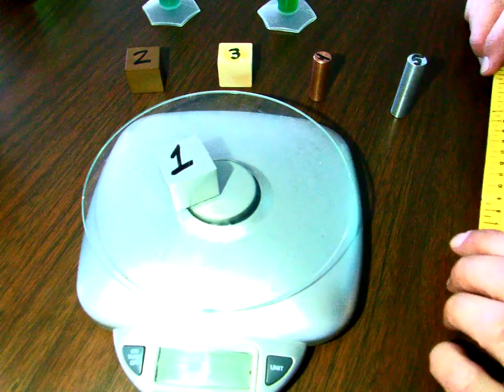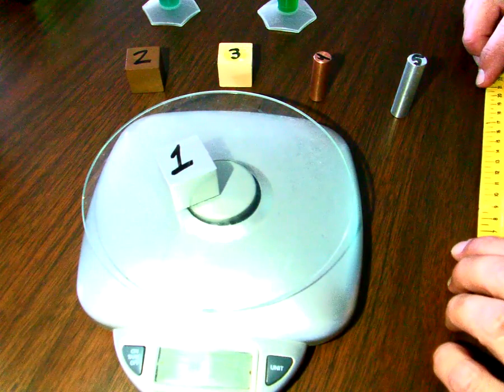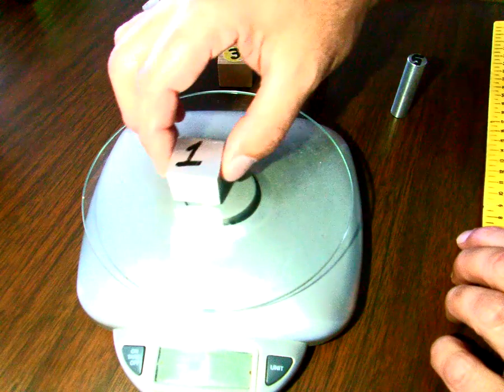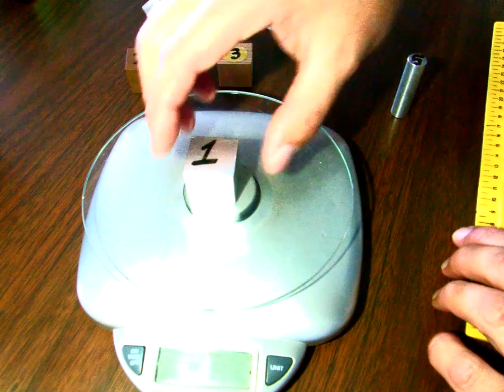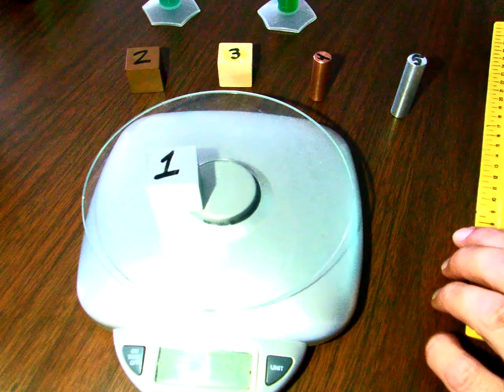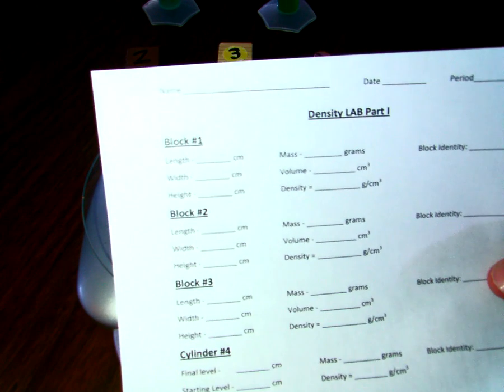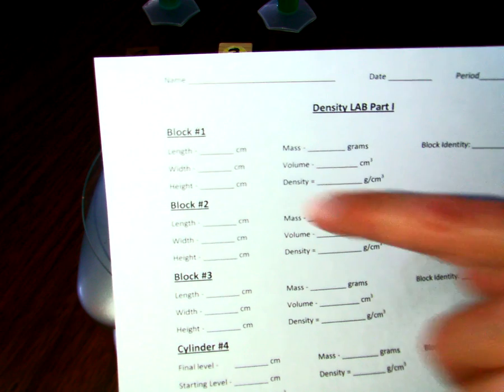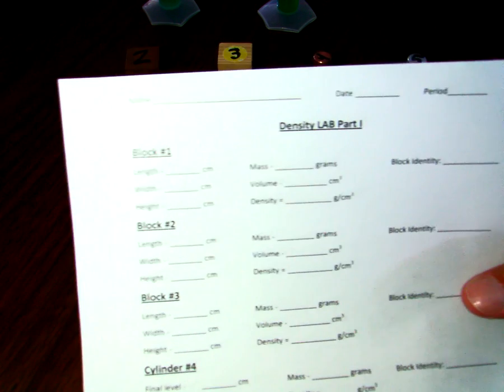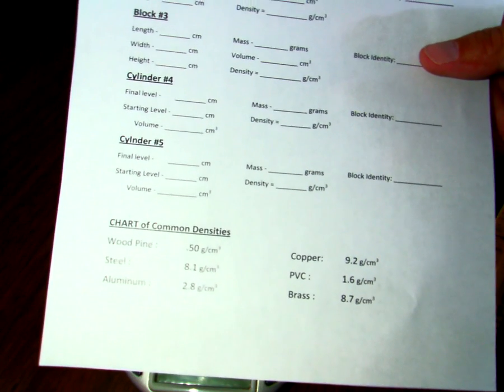We know that the formula for volume is big B little h, and big B stands for the base, which is length times width, and then you'll have your height. So go ahead and take a second to calculate your volume and put that into your answer document. There is a spot where you can put your length, your width, and your height for each item, so go ahead and make sure you take care of that. When we get the mass here, you'll put your volume there, and then you can calculate your density, and then we're going to identify our block using our chart of common densities.